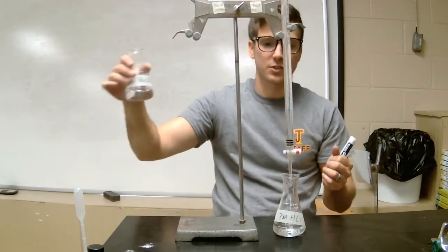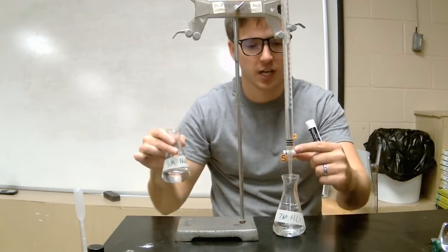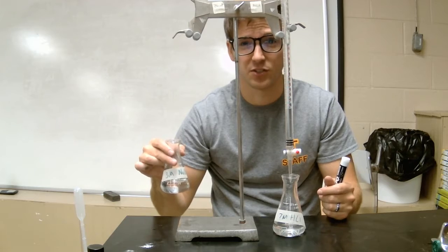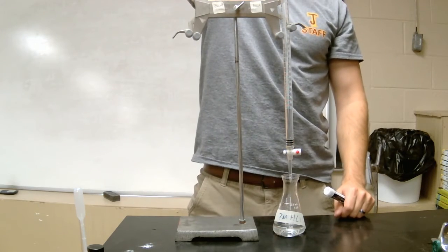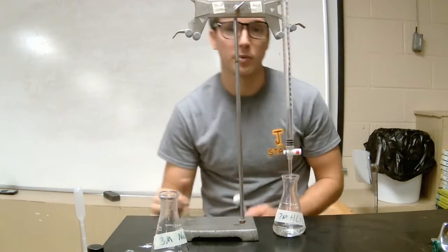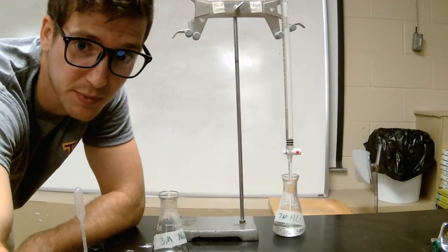So first things first, I'm going to fill this up with my titrant, my NaOH. I'm going to close the stopcock because if it's open, then the base will fall into our titrate, and we don't want that. So I'm going to go ahead and fill this up. Close to the top as I can go. You can't see it right now, but I will post a picture of what I see in my titrate up top.